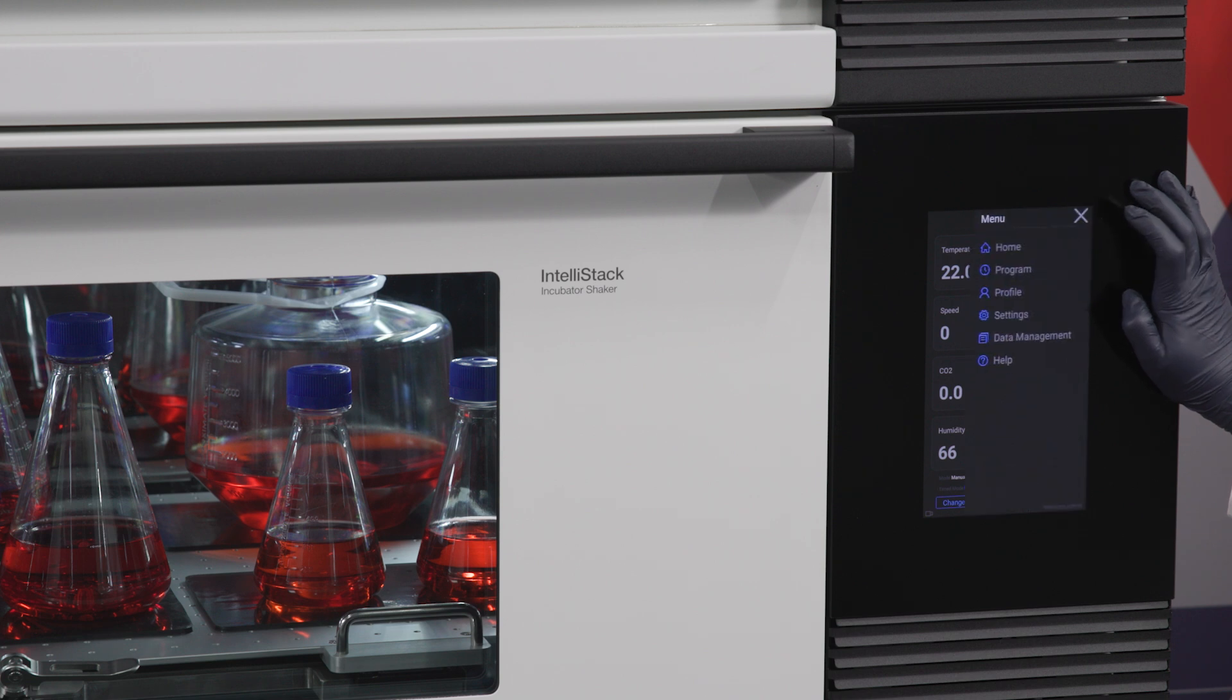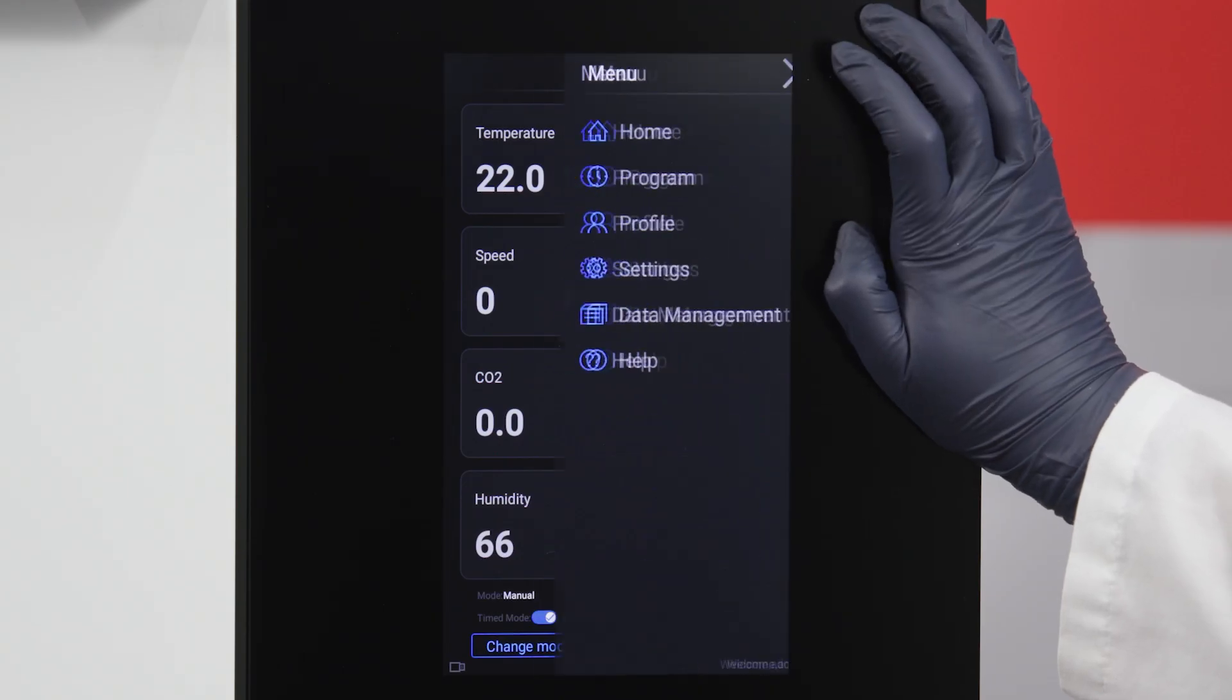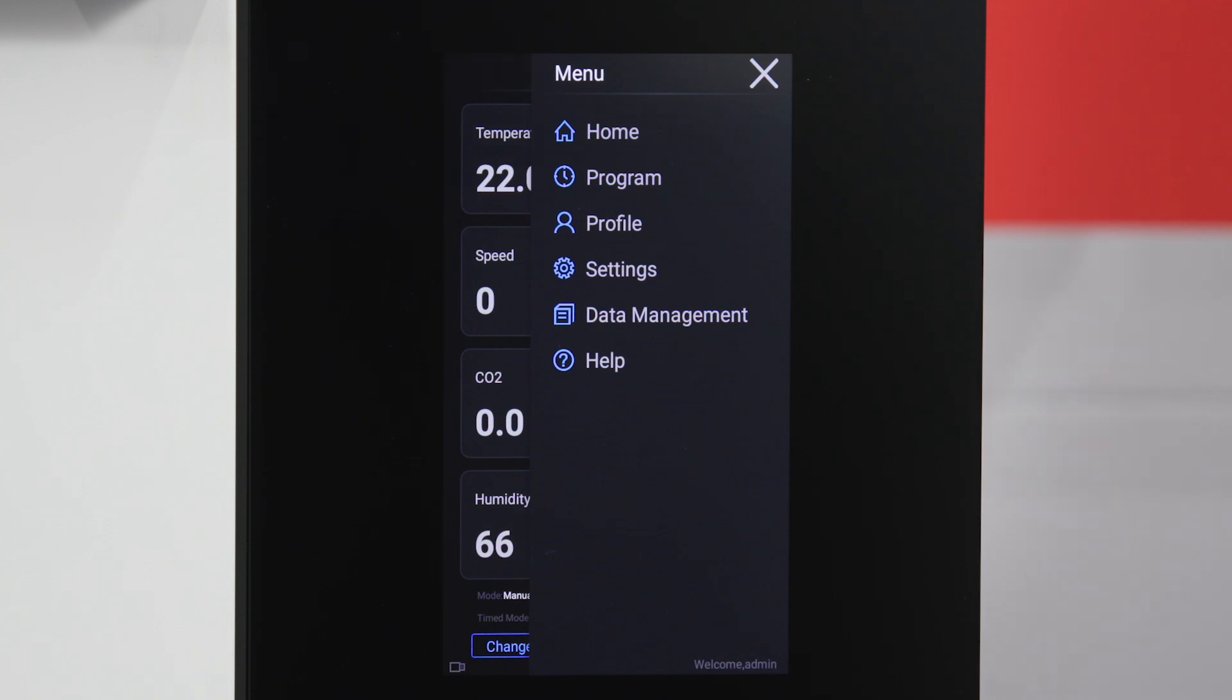Now, let's review the types of information and functions available through the menu navigation. Tap the icon in the upper right to expand the menu.